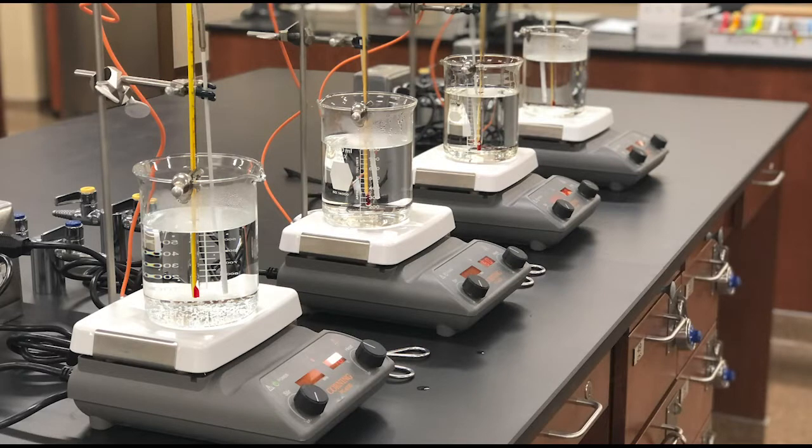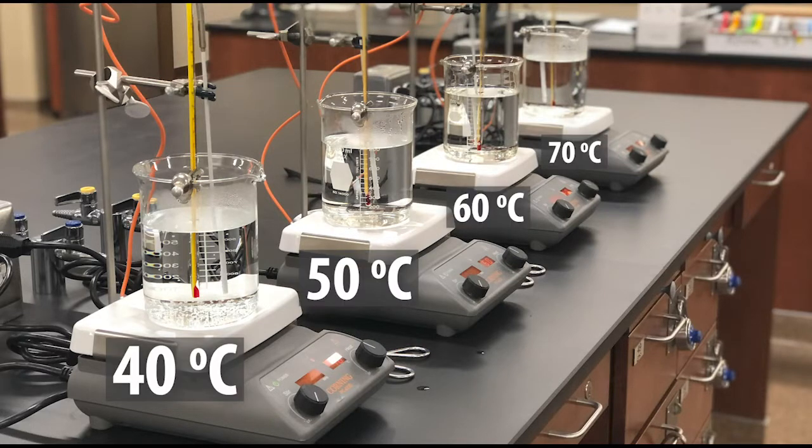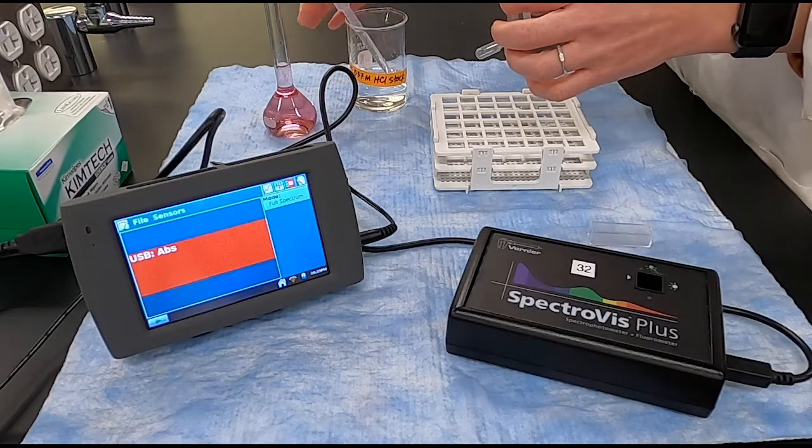We'll be using four water baths that are each at a different temperature, about 40 degrees, 50 degrees, 60 degrees, and 70 degrees, although you are going to want to record the actual temperature from the thermometer. We'll be collecting the absorbance spectrum of our solution at each one of these temperatures and also room temperature.